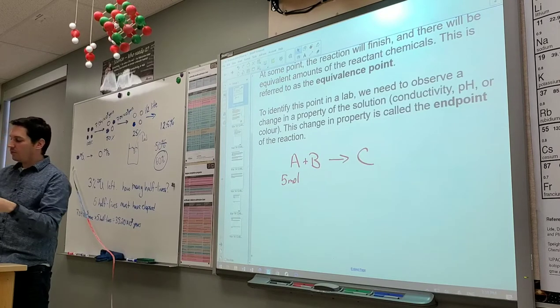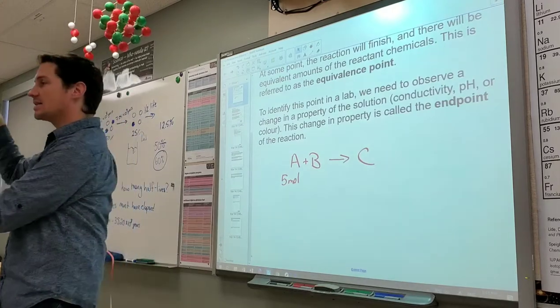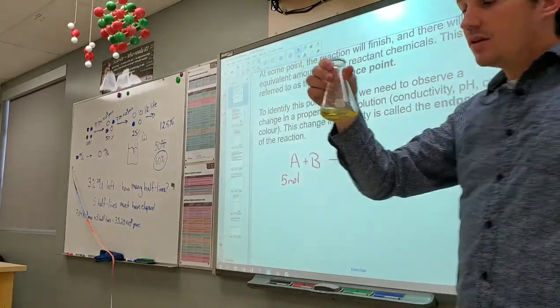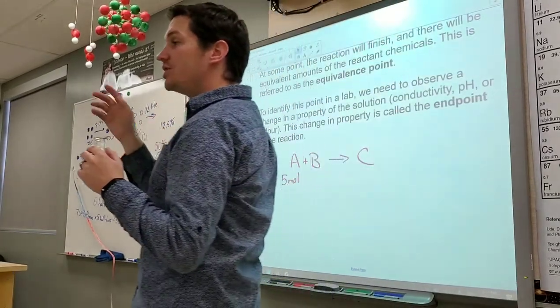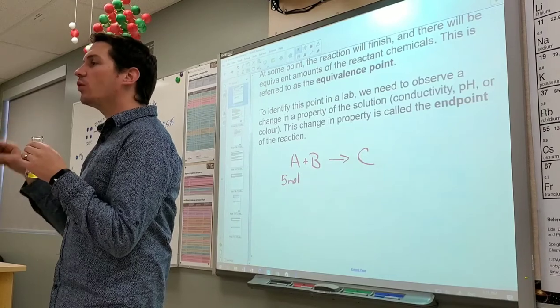And so, what happened as I added acid? What happened to the color of my solution? Yeah, it went from blue to yellow. Now remember, the color changed. Did you see a green in there? Yeah, you probably did, but it happened so quickly.